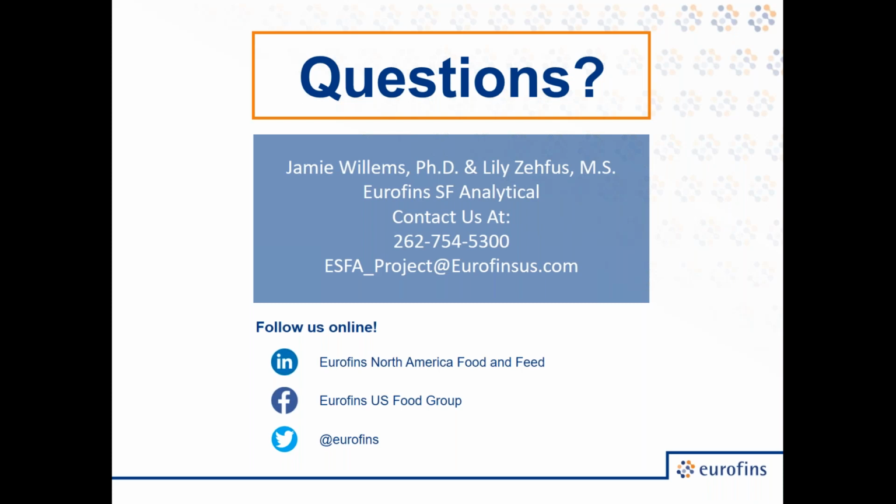So yes, we do apply many different techniques to try to investigate, but it's true that sometimes we see differences in compounds that don't have a known aroma, and then in that case, it can be difficult to know if that is actually linked to the off-odor or not.